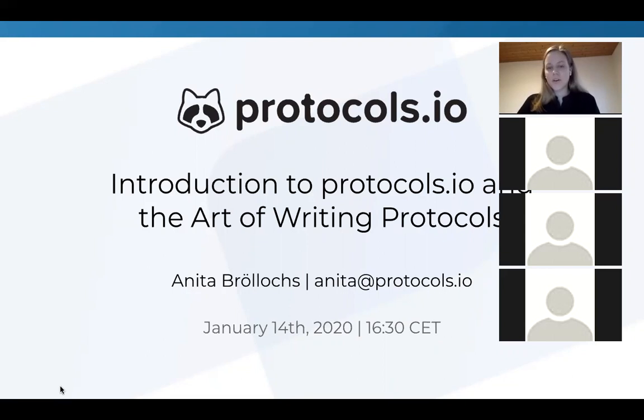My name is Anita Brollox and I'm the head of outreach at Protocols.io, and today's webinar will be an introduction to Protocols.io, and then the second part is what I call the art of writing protocols, because really there's an art to writing reproducible protocols.